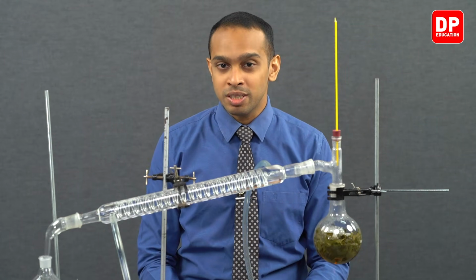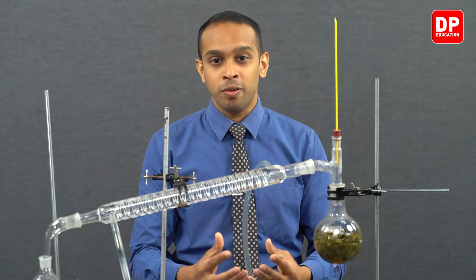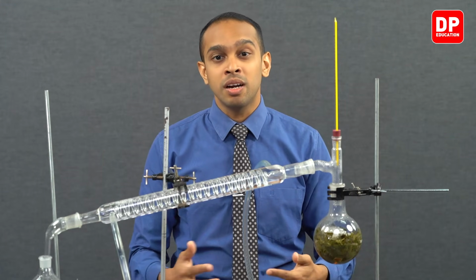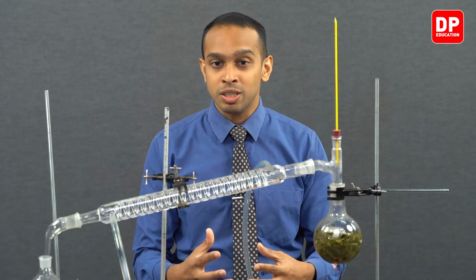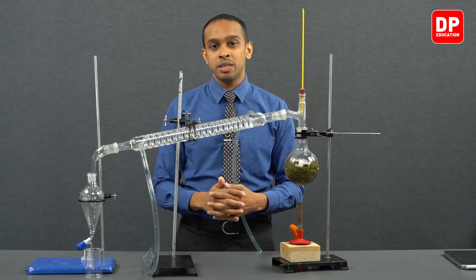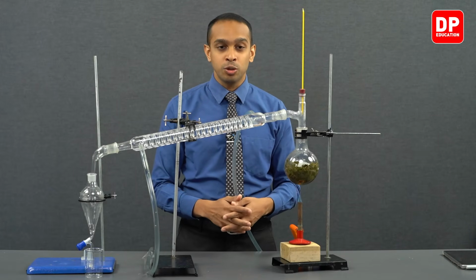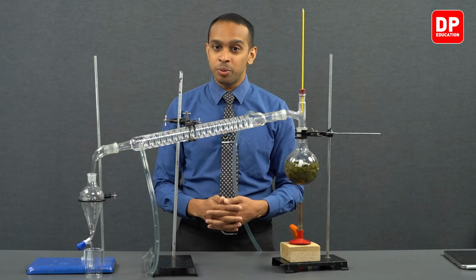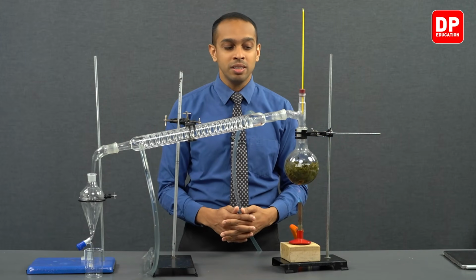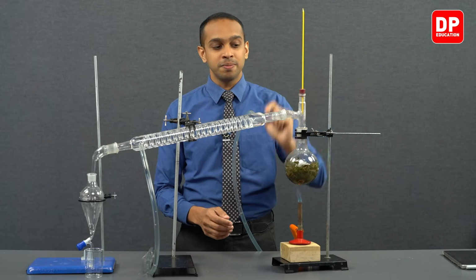This is because, as I mentioned earlier, this produces a mix of the essential oil and water, which are two immiscible liquids. And as this mixture boils, they will boil at a lower temperature than the boiling points of each of these constituent immiscible liquids. So we can very clearly see that the boiling point is at 99 degrees Celsius here.